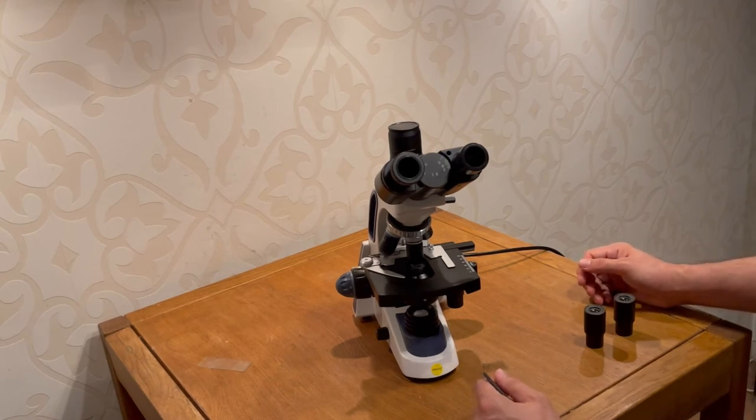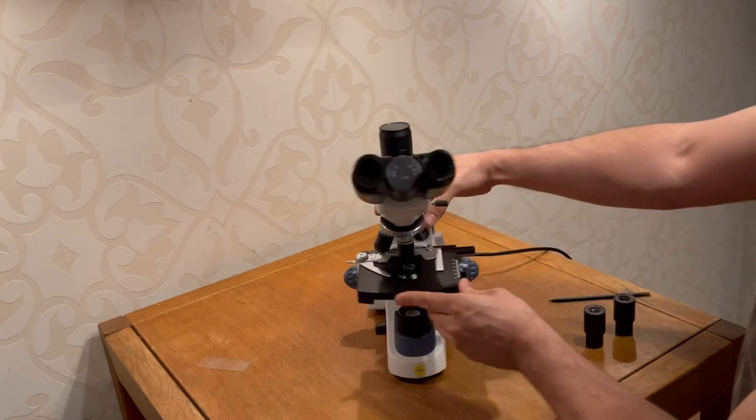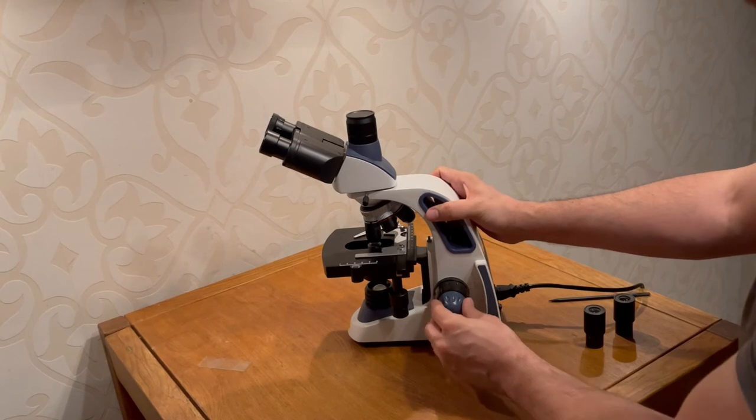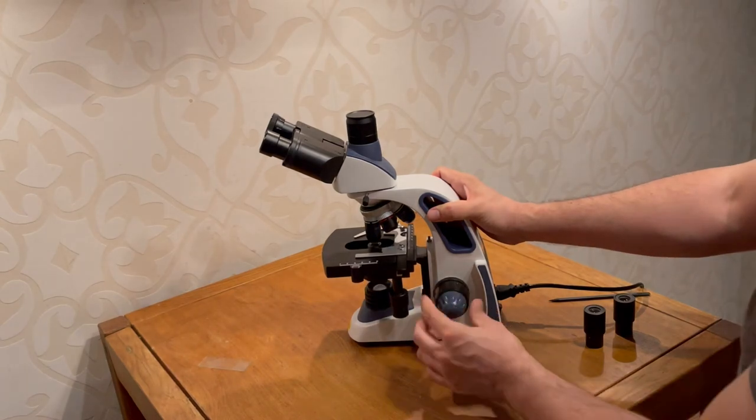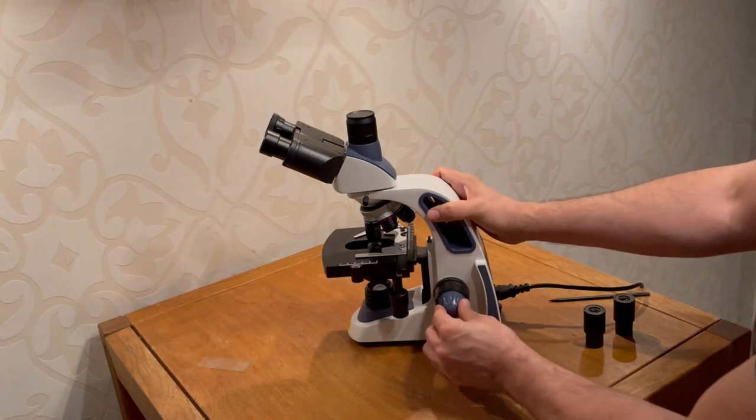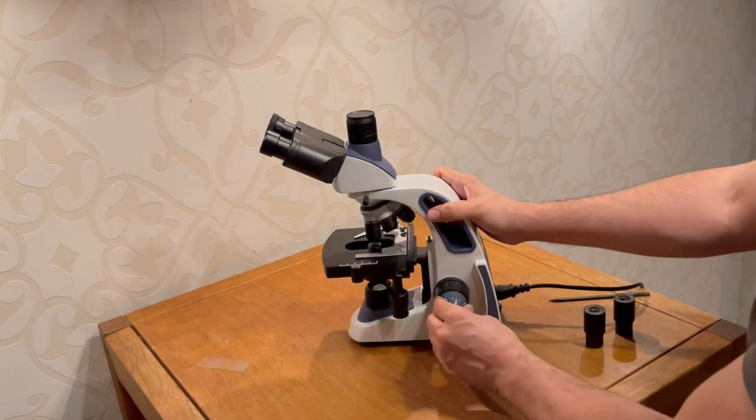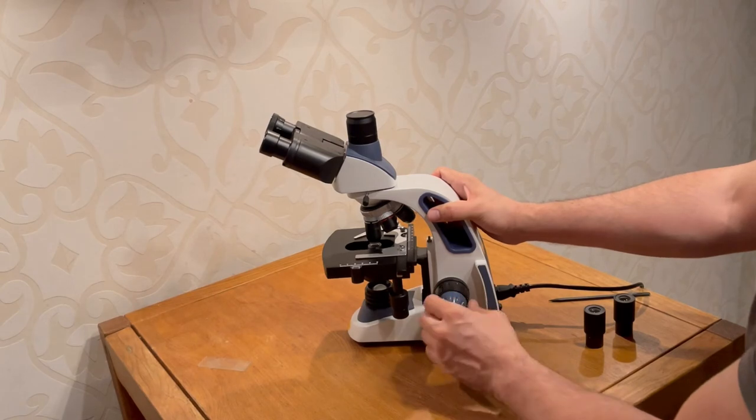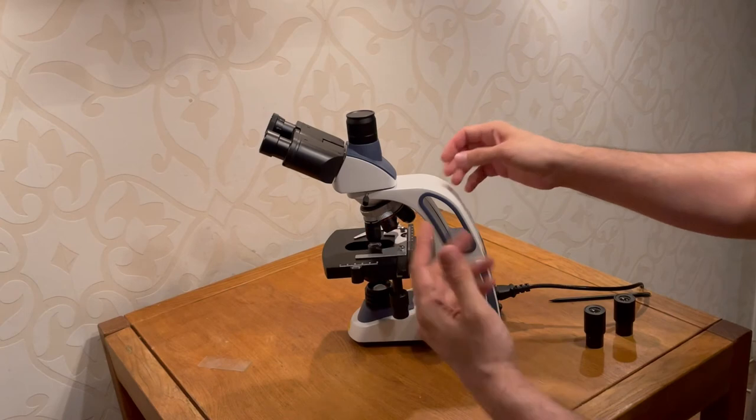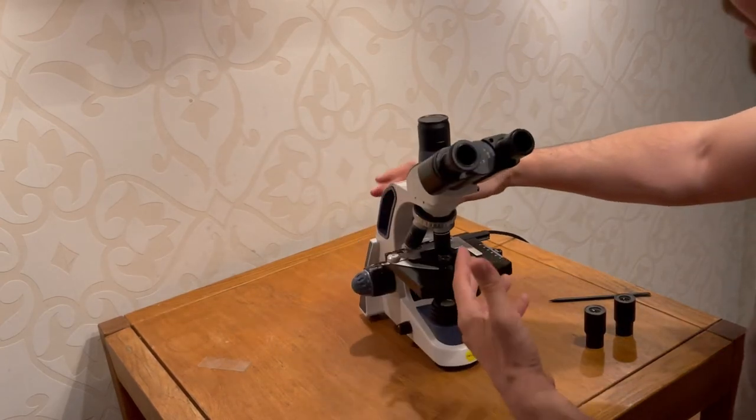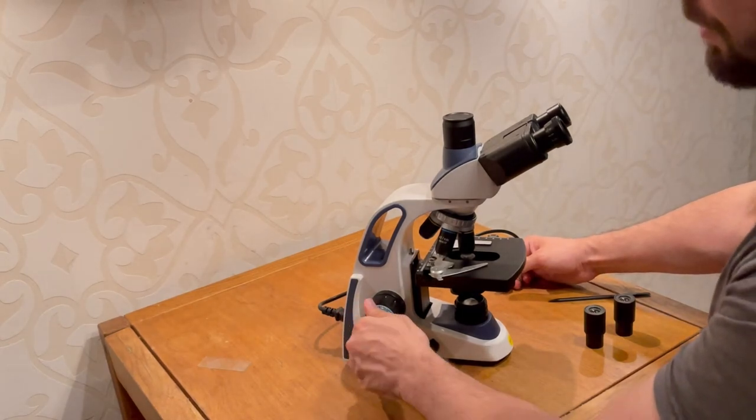The third thing, which I think is quite large, is these heat adjustment knobs. The coarse one is working quite nice. But when you get to this fine adjusting knob, it seems like you have to spin it at some point with the effort. Like, it seems like the axis they are sitting on is bent somewhere. And this has to go really smooth, because you have to do fine-tuning. It's one of the defects.